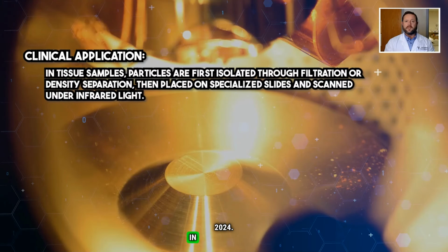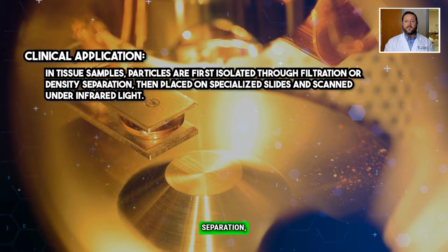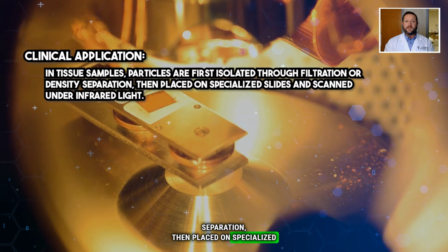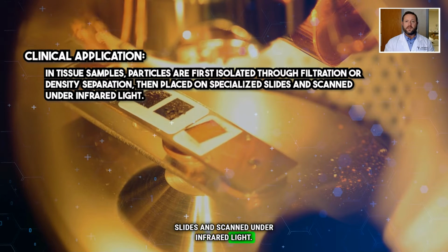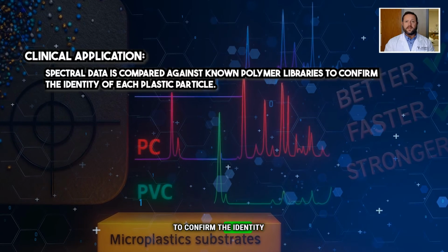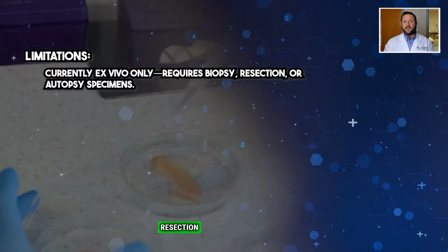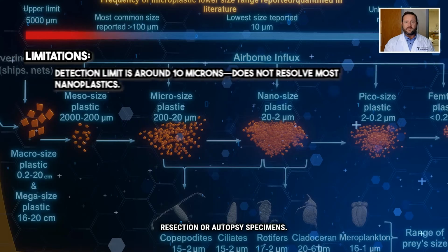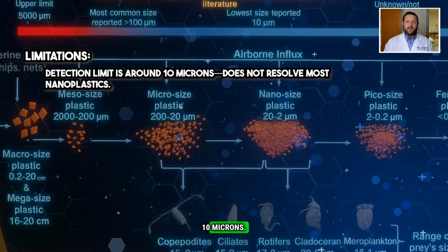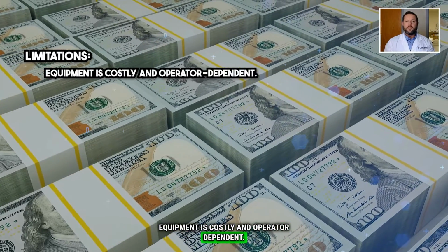In tissue samples, particles are first isolated through filtration or density separation, then placed on specialized slides and scanned under infrared light. Spectral data is compared against known polymer libraries to confirm the identity of each plastic particle. Limitations: currently ex vivo only, requires biopsy, resection, or autopsy specimens. Detection limit is around 10 microns, does not resolve most nanoplastics. Equipment is costly and operator dependent.